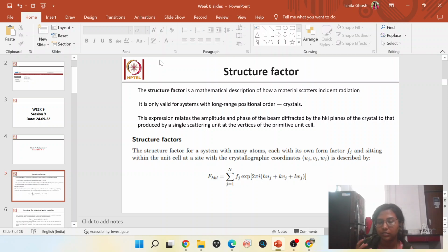If the crystals are centrosymmetric, then there is normal elastic scattering. But if the system is non-centrosymmetric, then sometimes it can cause this anomalous dispersion or anomalous scattering. But usually we take it as elastic. Okay.